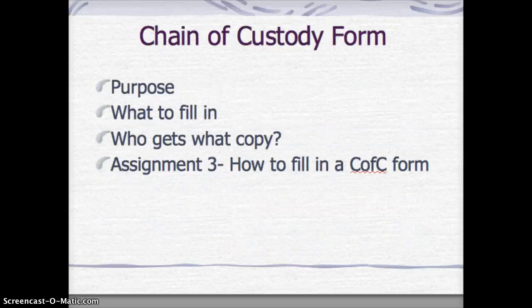So, a chain of custody form. What is its purpose? The purpose is to make sure that the documentation of whoever has touched that sample in the chain of getting it from collection to the lab is recorded, so that you just have more security in knowing who did it.